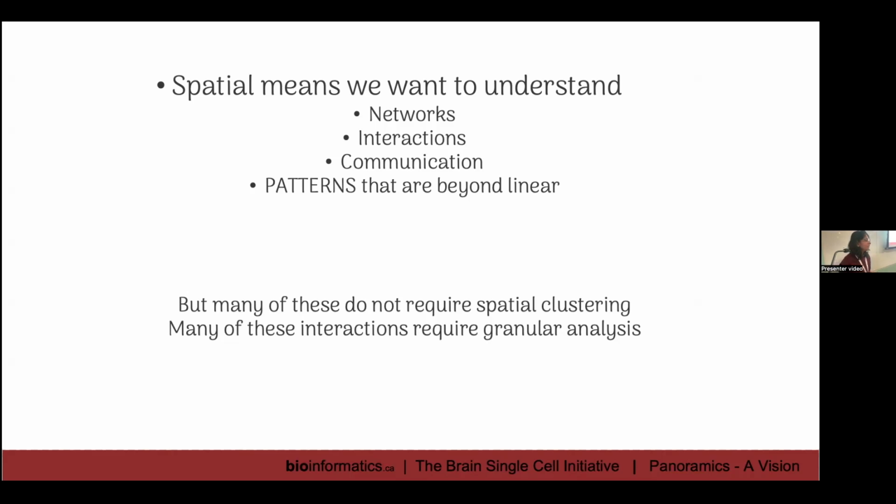The thing is, the mouse brain or the human brain is very well structured. And okay, Javaria is looking at me, so is the liver. I'm talking about structure. Most of you, I think half of you, will be working on brain.